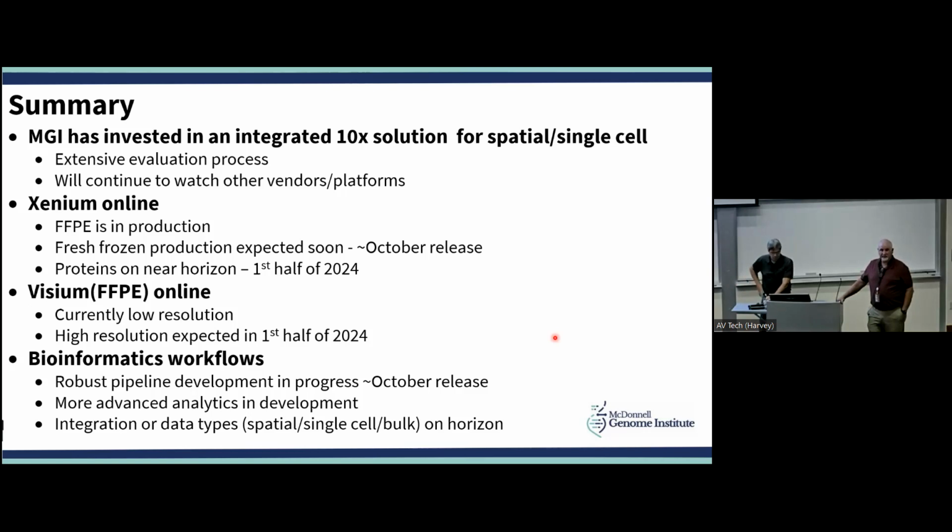Again, that would be a custom add-on, a custom probe set, much like you would target a human transcript, for instance. You could target your reporter gene transcript. The processing is the same. Those probes will be integrated in amongst the panel, or potentially you could have a pre-designed panel. You could integrate 50 customs for reporter genes or whatever it might be and target in parallel.